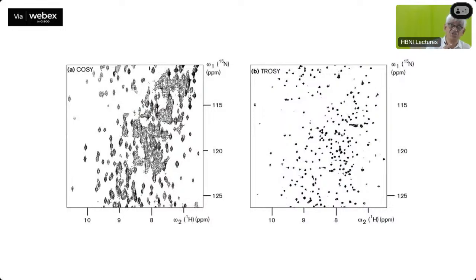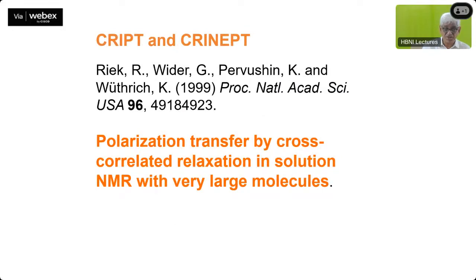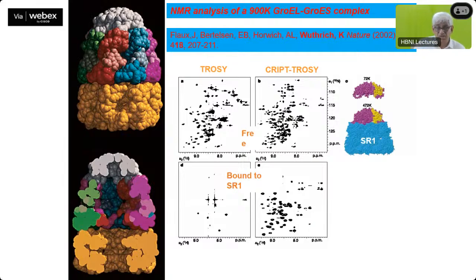In a large system and at a higher magnetic field, you will get this. The idea here was to go to larger and larger protein systems. And the normal HSQC will not help you there. This is very difficult to analyze. Therefore, you do this development, then you have this very sharp peak that you can actually analyze. And you can do even better, which is making use of the INEPT sequences there. We will not go into that. I will only show you the results here.